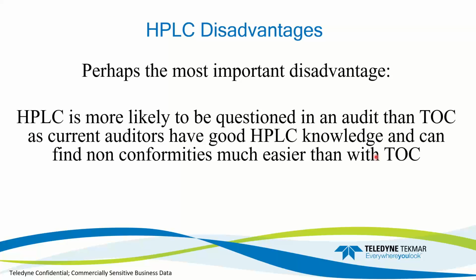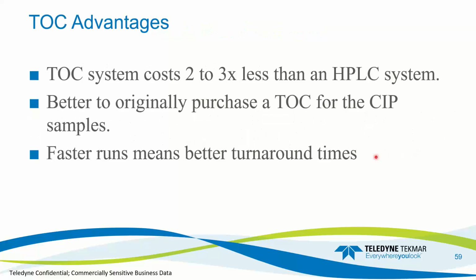One thing about the HPLC, it's more likely to be questioned in an audit than TOC, as current auditors have very good working knowledge of the HPLC and can find nonconformities much easier than with TOC.